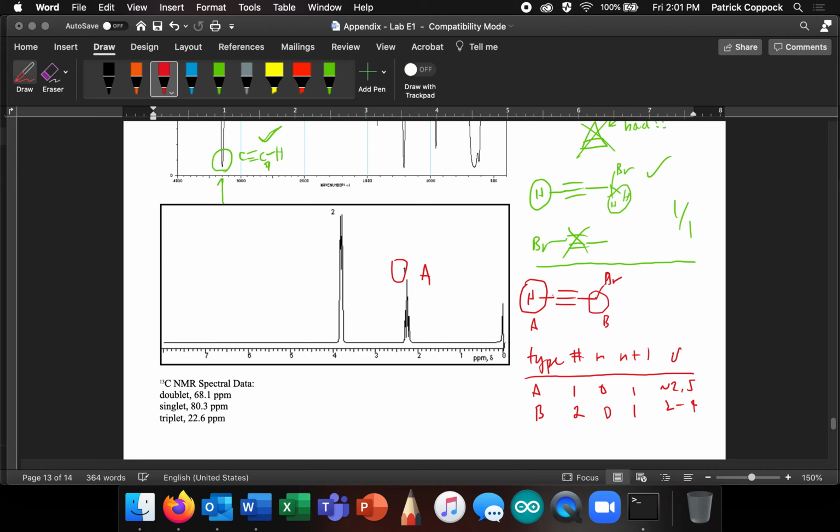this would be, these 2, what do they call it, diastereotopic? No, they're enantiotopic hydrogens, right? They're actually not identical. So they do split each other a little bit, and they're right there. So, yeah. I hope that's right. Someone watching the video who really knows is going to call me on it, get really mad if I'm wrong. So, all right. So far so good. Let me erase that because that was the last point. Let me come here and say I got my 1 out of 1 for my prediction.